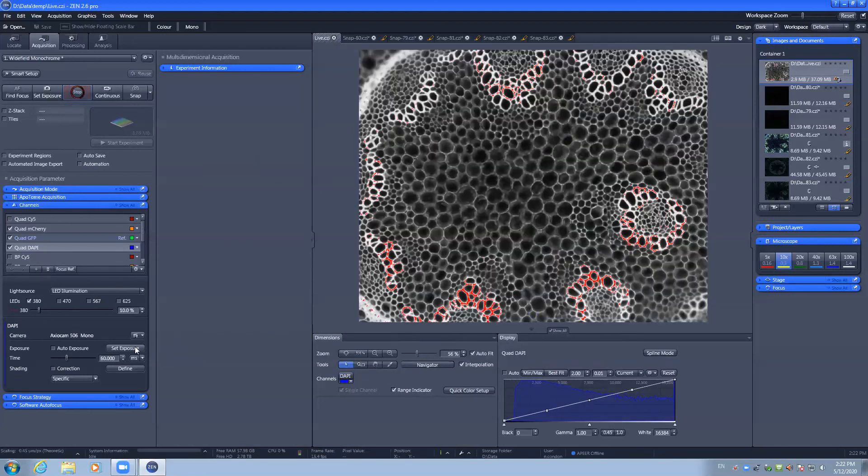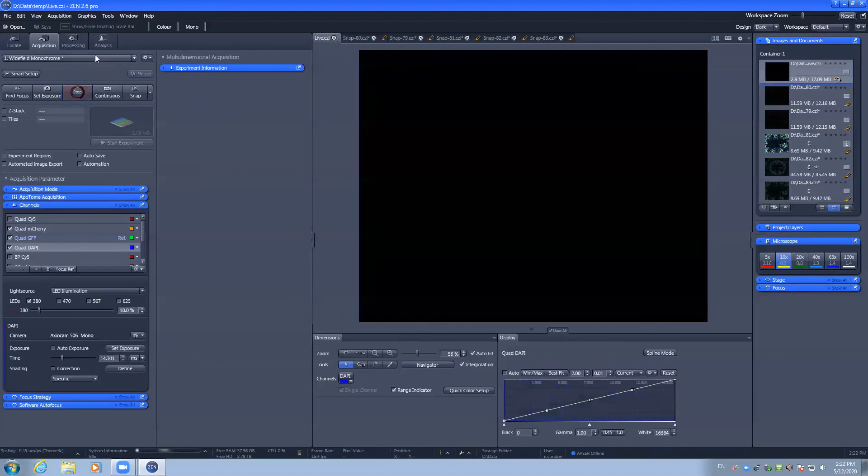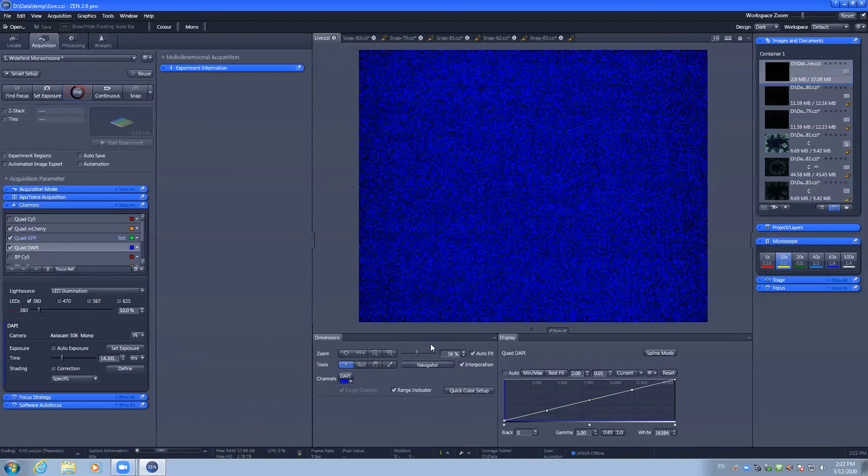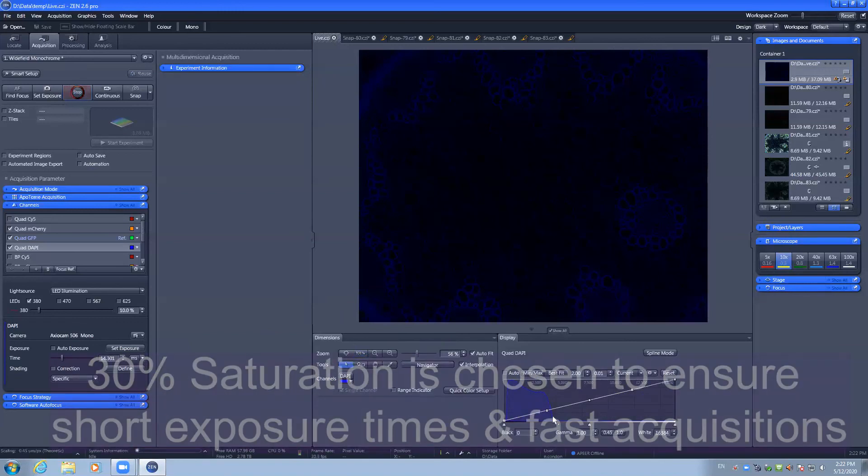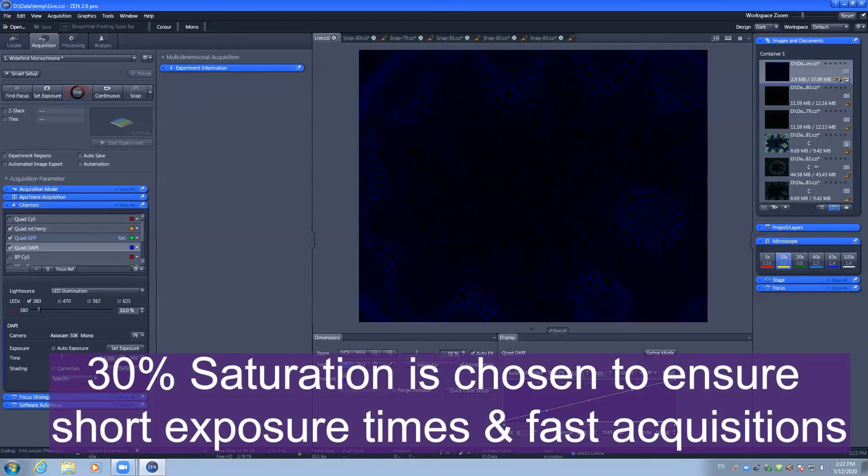The set exposure for wide field monochrome is set to ensure that the dynamic range reaches approximately 30% of the chip, which is usually sufficient if you need to perform downstream applications like deconvolution.